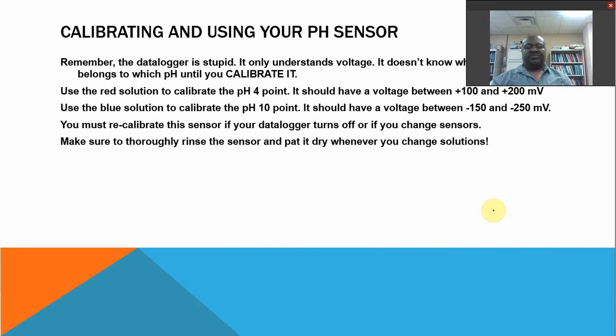Calibrate the pH sensor. How about calibrating the conductivity sensor? Well, that has to do with just dipping it in distilled water for a little while so that it cleans itself. I call it waking itself up from slumber. It's been sitting there completely dry for months, sometimes years, so it needs to hydrate properly. You should read a low conductivity, typically 50 microsiemens per centimeter for distilled water. That means it's good.